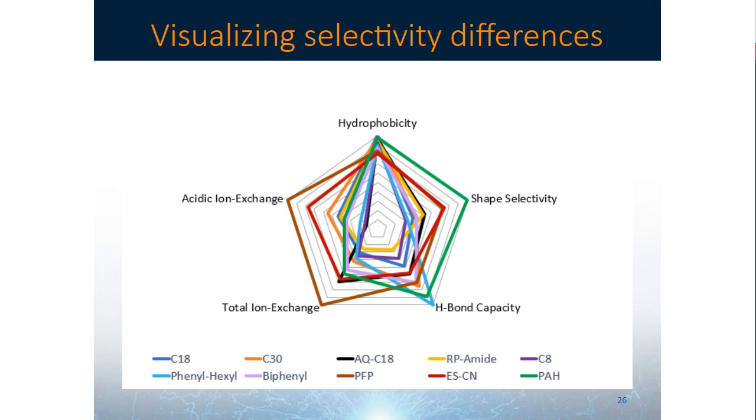Okay. For metabolite analysis, especially those complex mixtures of various polarities, do you have a recommendation for a stationary phase or phases that would be best to initially screen? Yes, I would. When you have those really polar compounds, sometimes you need to start at gradient conditions that have no organic or very low organic. And in those cases, you need a phase that is 100% aqueous compatible.